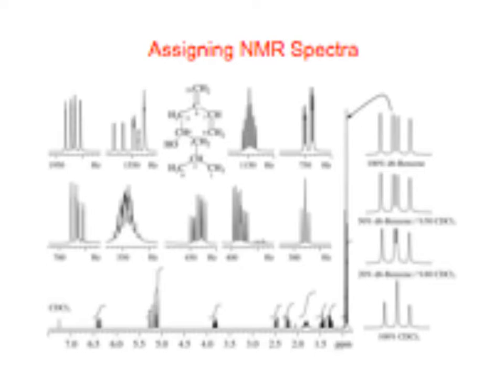What about the OH? No, it's not rotation around here. The shielding of the lone pairs on those protons. Well, why does it affect the two methyl groups differently? Proximity, when one's closer than the other. I mean, that bond should freely rotate. That's fine, but if it freely rotates, it still is going to. Hydrogen bond.